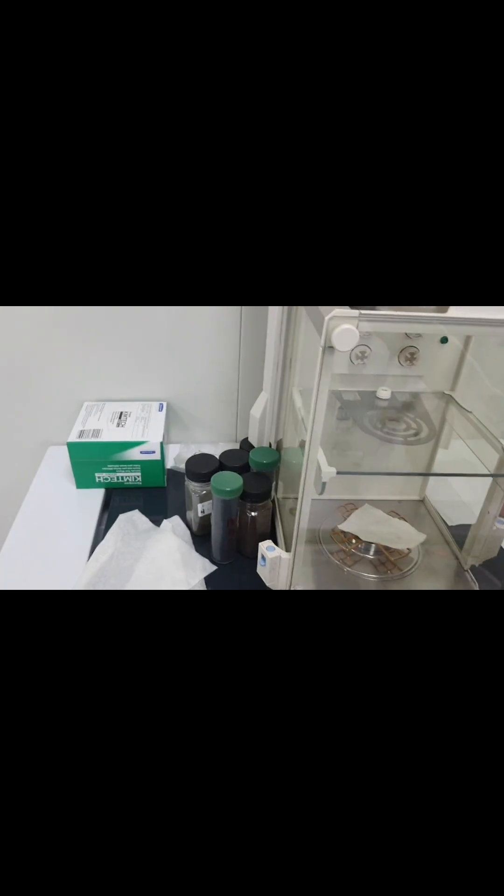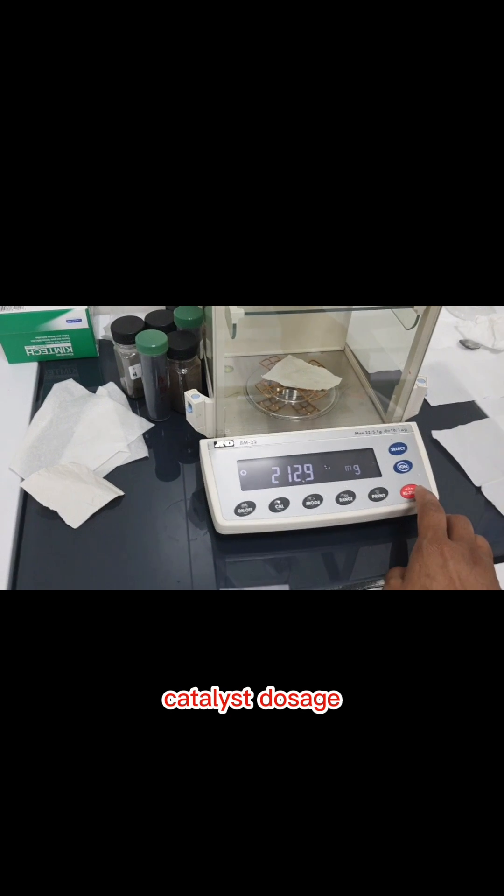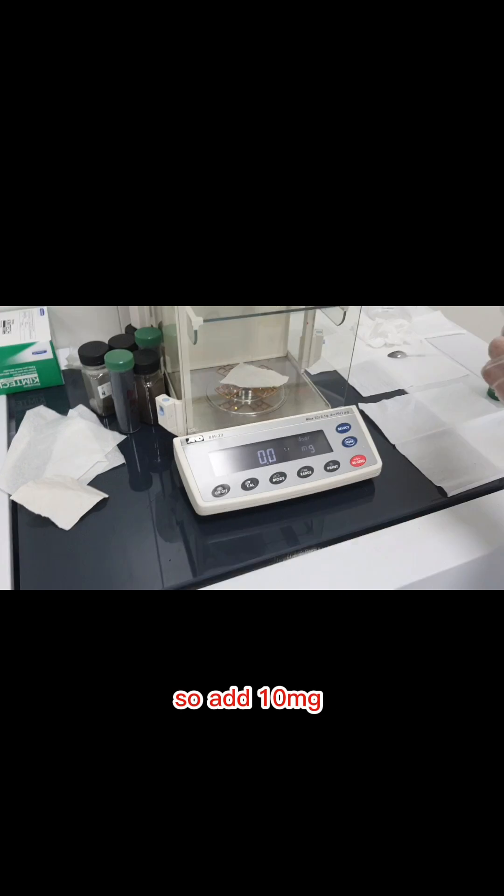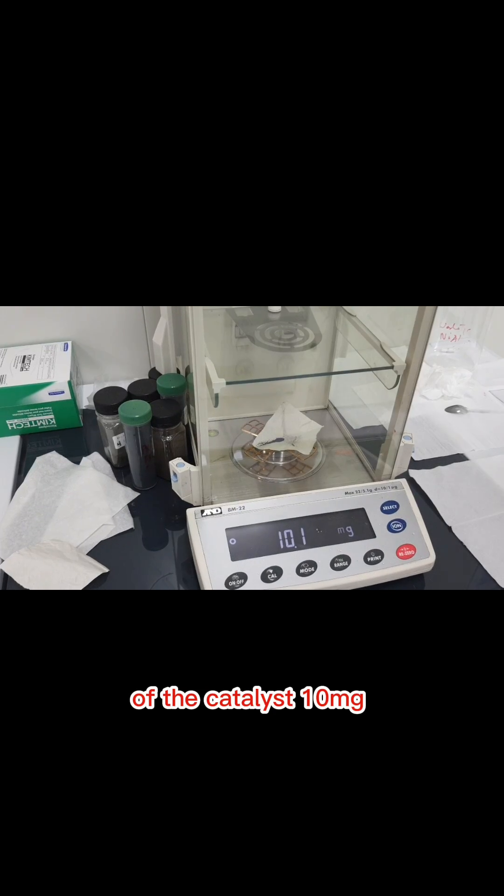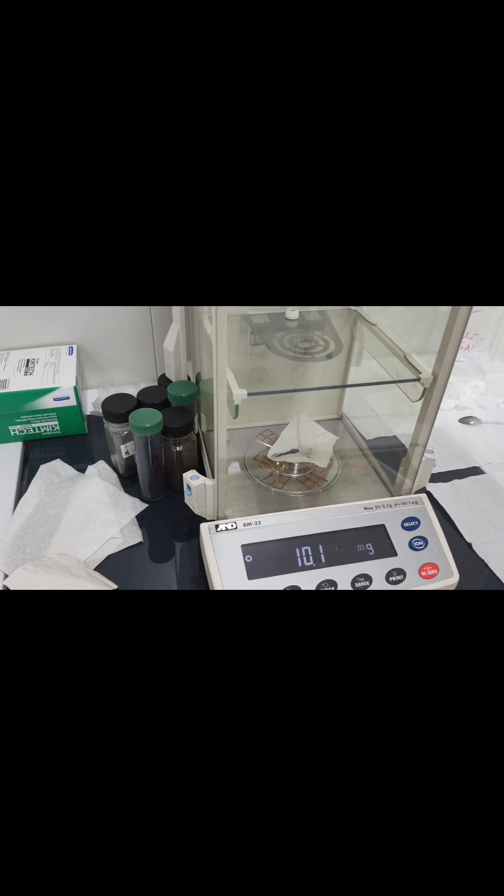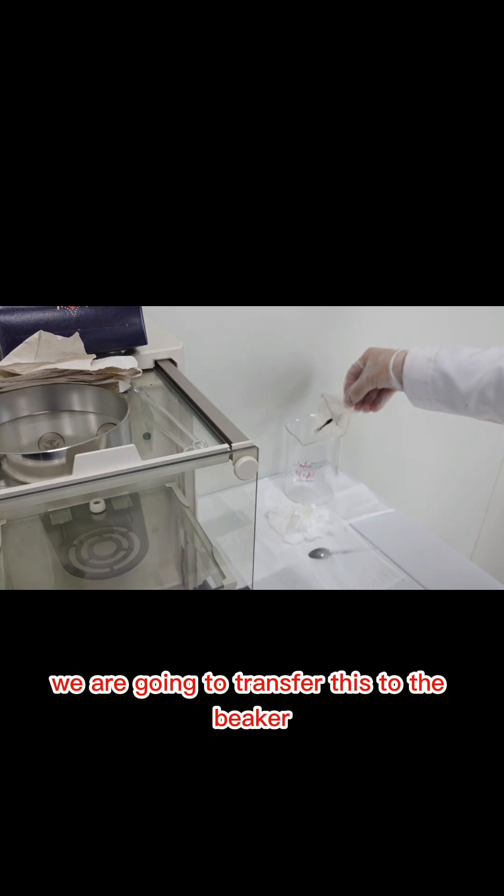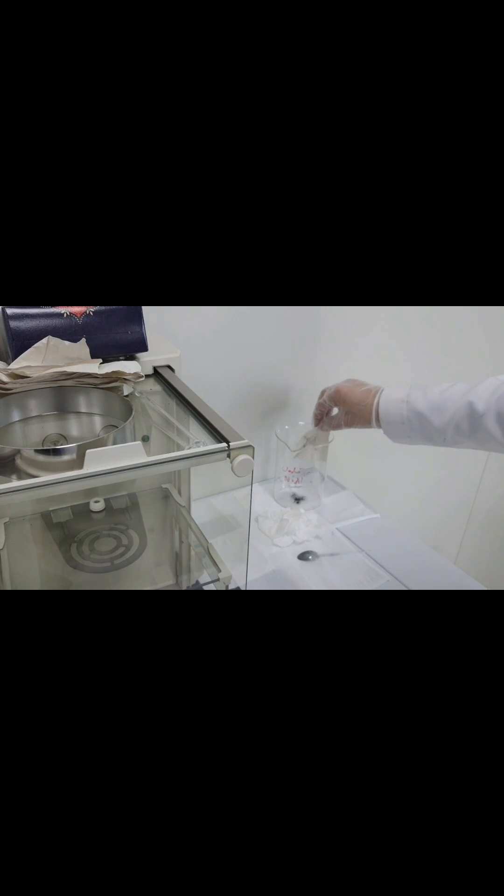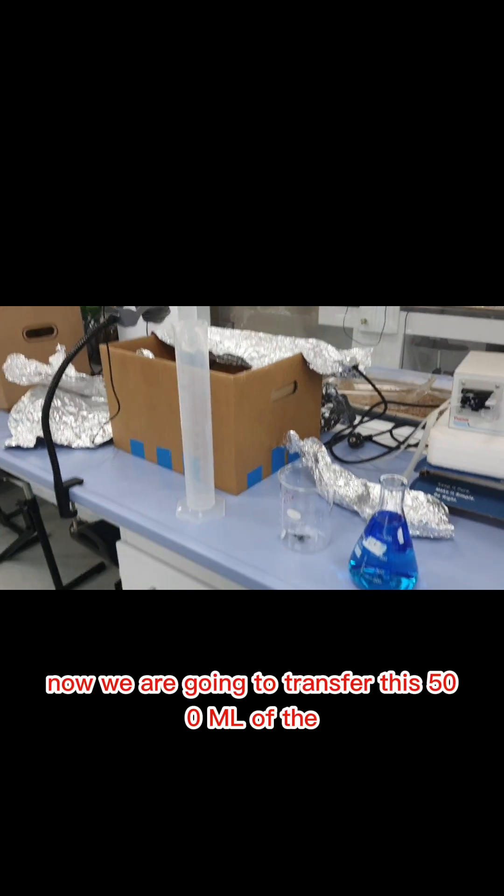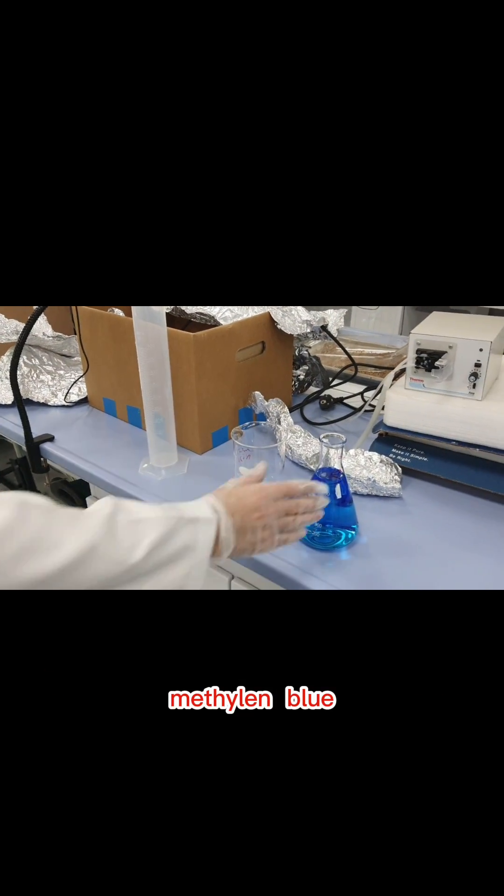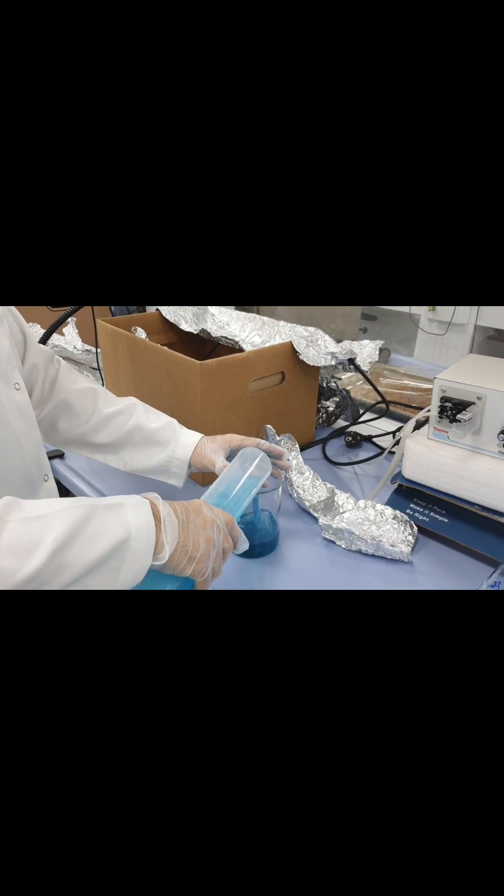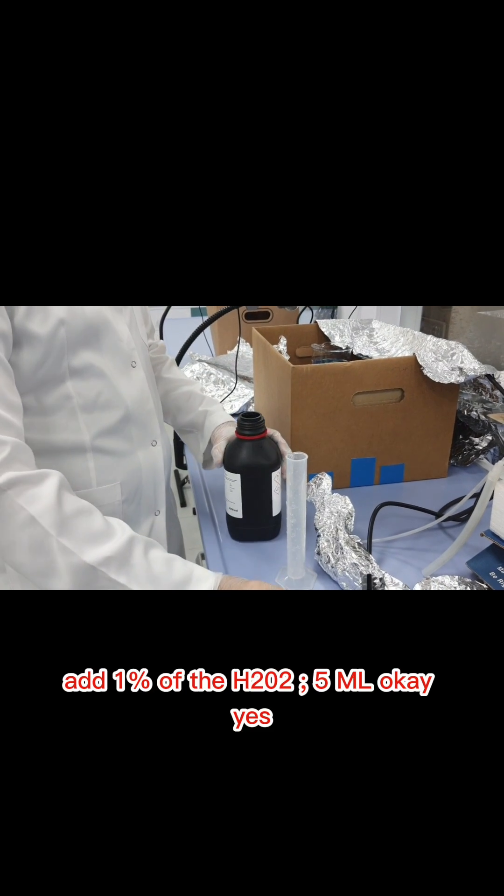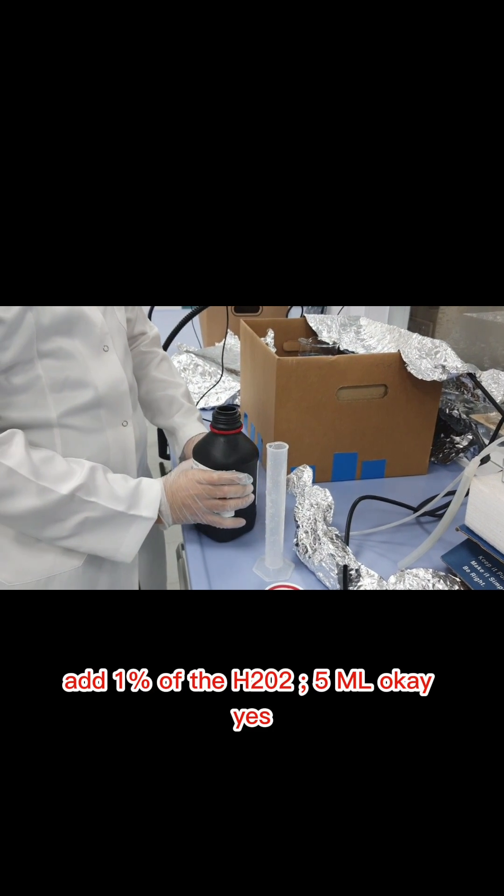We are going to measure the catalyst dosage. Add 10 mg of the catalyst and transfer this to the beaker. Now we are going to transfer 500 ml of the methylene blue with the help of a cylinder. Add 1% of the H2O2, 5 ml.